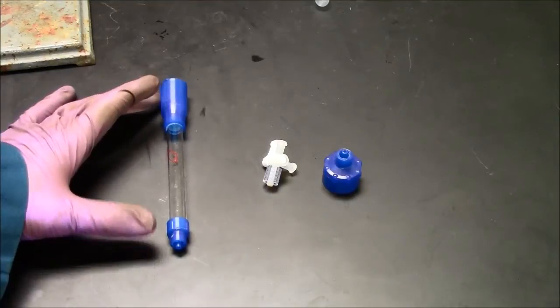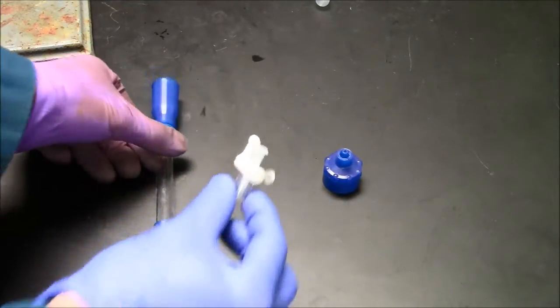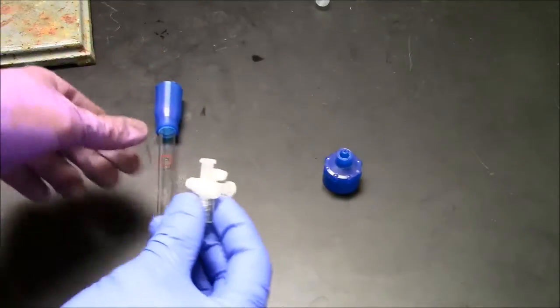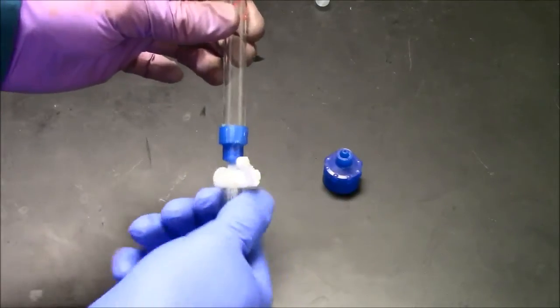This is a flex column, sometimes called an econo column. This is a stopcock. This has three positions. It will attach to the bottom of the column, screw tight.